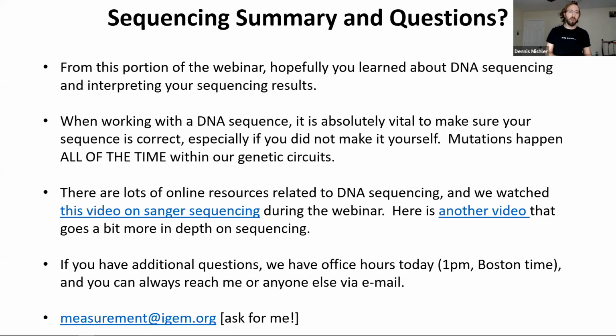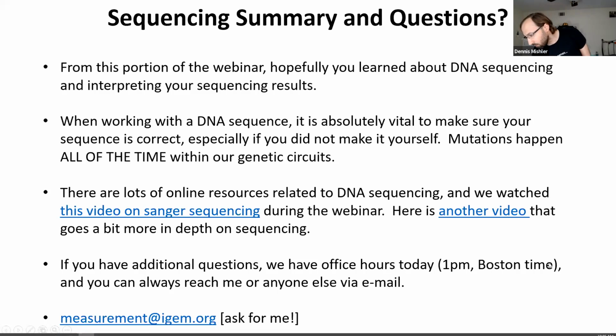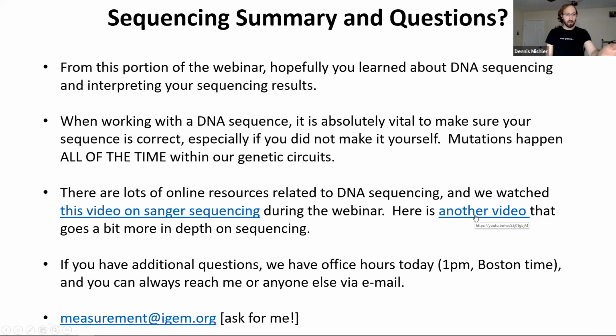Mutations happen all of the time in genetic circuits. So even if you got a sequence from somebody else in another lab, that doesn't mean it's correct. It could be mutated because of the time it took to grow. So you want to just resequence it when you get it, all right? There are lots of resources online. I did show you that one video that was really brief. That link is here again. There's a second video in the links if you want a little more involved explanation for Sanger sequencing.